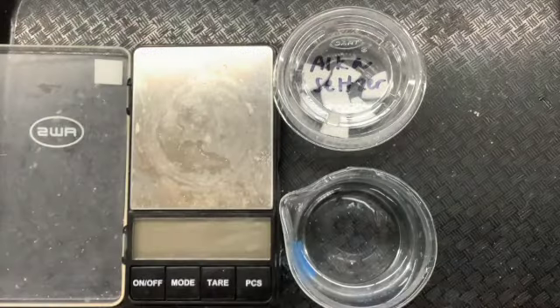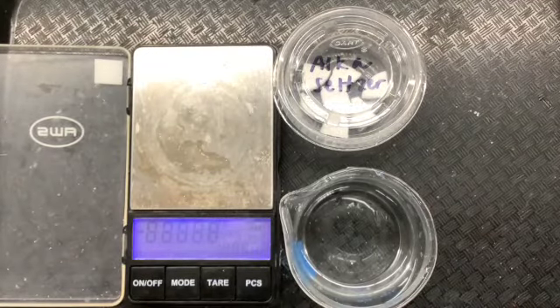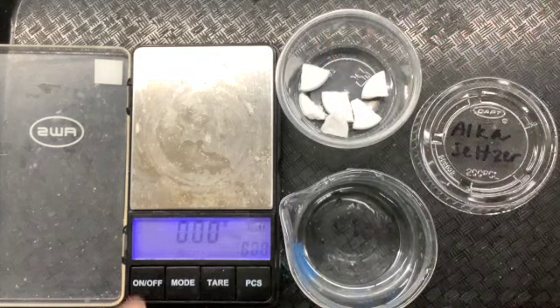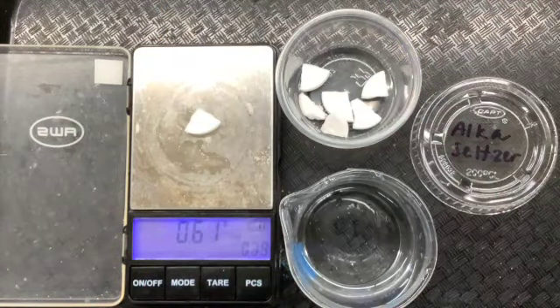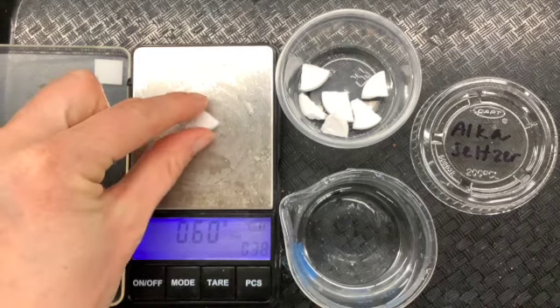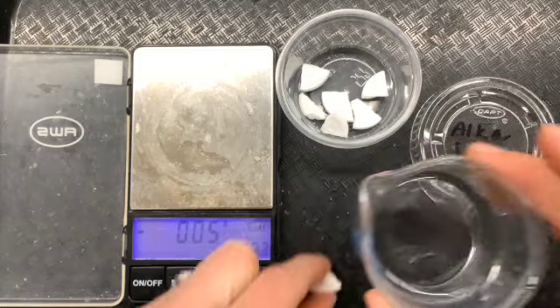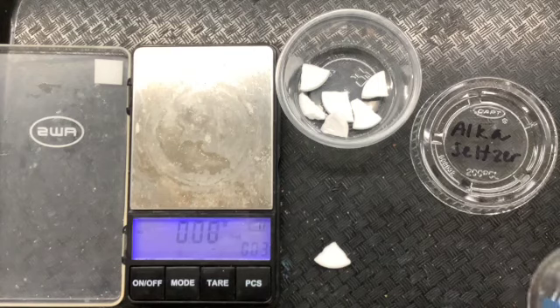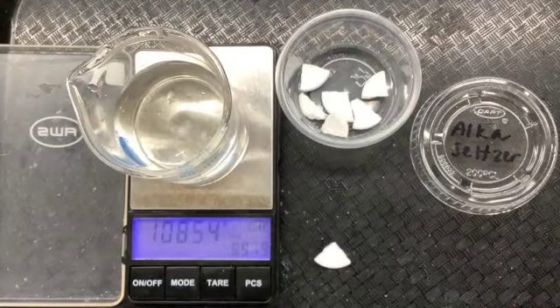All right, so on our procedures, our first thing is we're going to weigh 1 tablet of Alka-Seltzer. So the mass of this Alka-Seltzer tablet is 0.6 grams. All right. Next, we have 60 milliliters of water, and we're going to weigh the mass of the beaker plus the 60 milliliters of water. Oh, we've got to tare it again. Okay, so 108.54 grams.